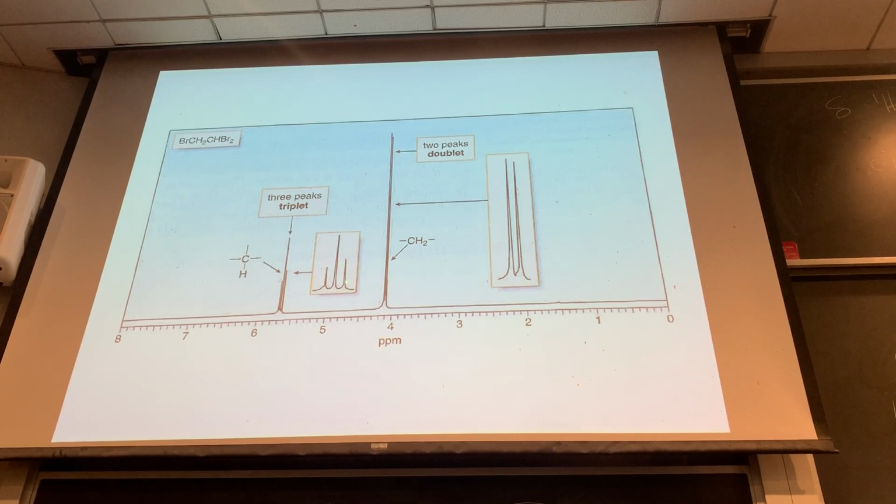You see this inner height's a little bit higher, and notice it's leaning towards, coupled to something to the right, and you see this doublet, it's coupled to that inner peak here, leaning toward its coupling partner, a little bit higher there. Sometimes you can use that effect to tell. So the probabilities of spin states are not equally populated, and that has to do with the orientation of the magnetic field and what they're coupled to, which is kind of cool there.